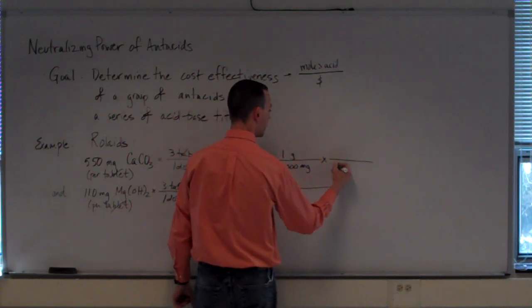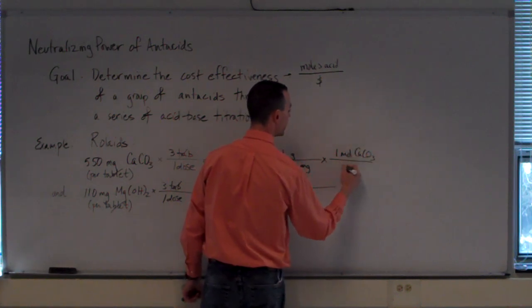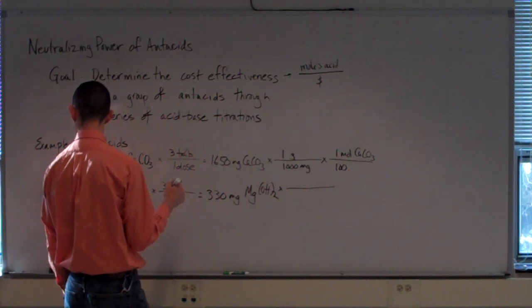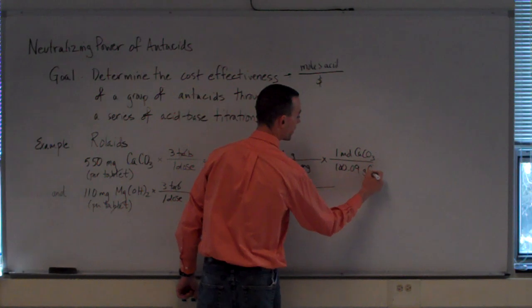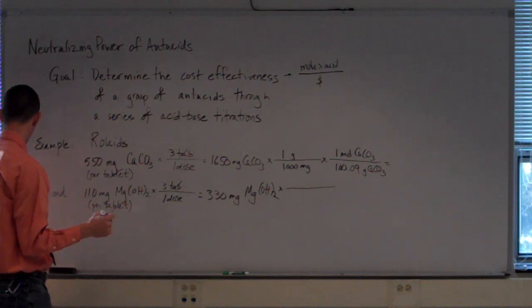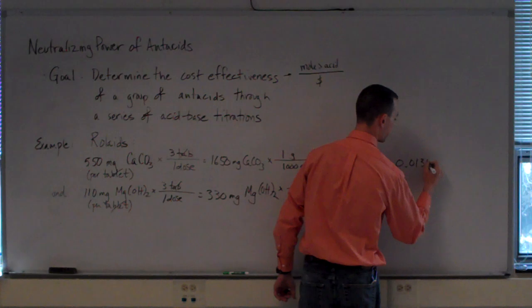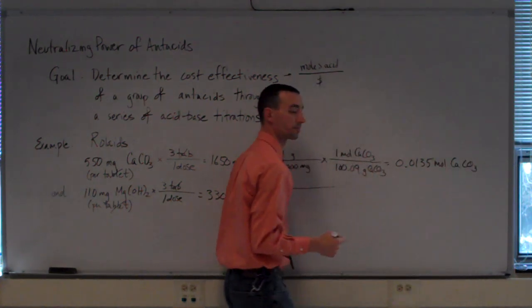And then for calcium carbonate, a mole of calcium carbonate is 100.09 grams. So a dose of Rolaids contains 0.0135 moles of the calcium carbonate.